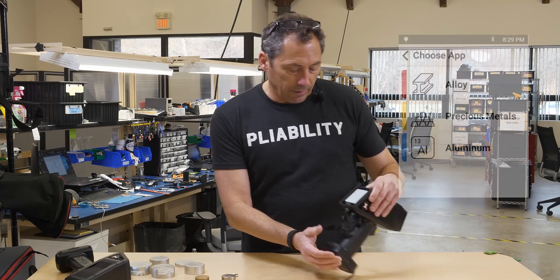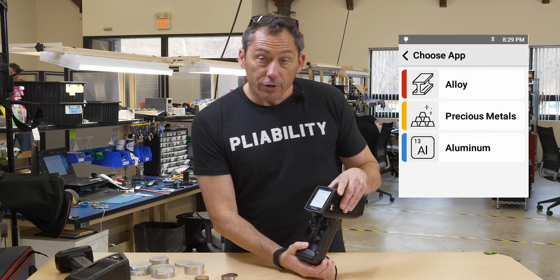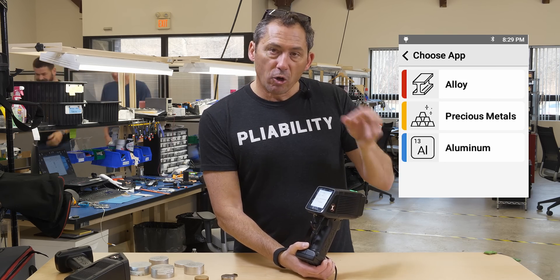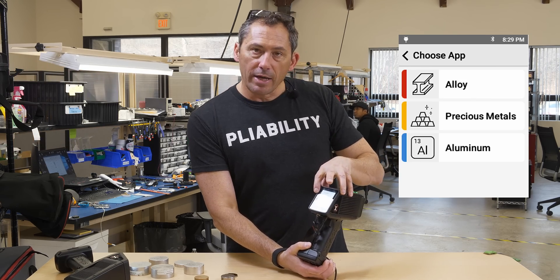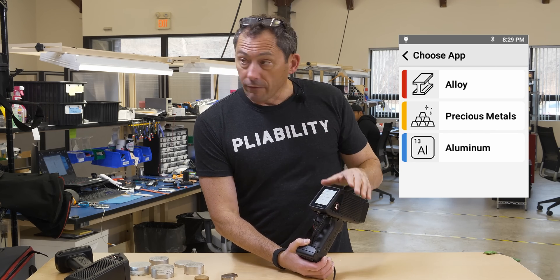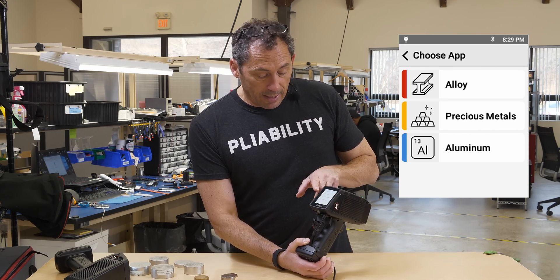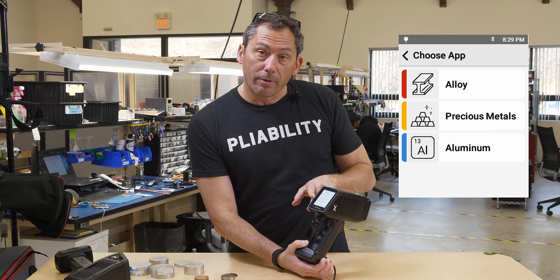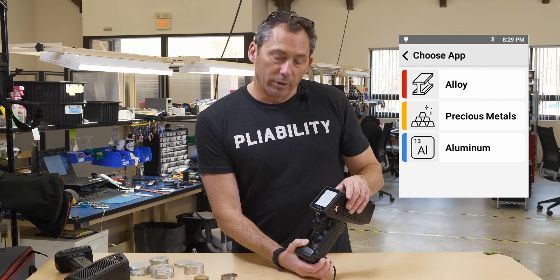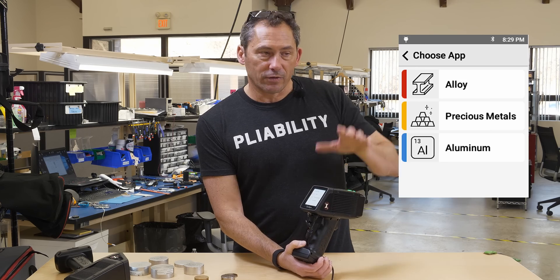If we look at the back of the instrument on the UI, when you turn it on, on the scrap unit — which has been purpose built for scrap — you get your alloy app, which you can use for sorting any kind of metal. You also have our own proprietary patented aluminum app, which is a dedicated aluminum sorting app made to sort any aluminum alloy in about one second.